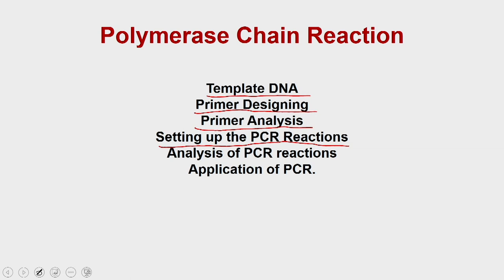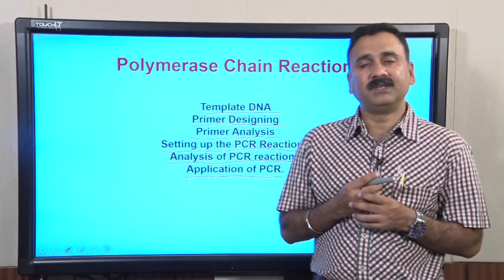reactions, how to add the individual components, and what precautions you should take while setting up the PCR reactions, and we'll take you to our lab and show you how to set up these reactions. In addition, we will show how to set up the different steps within the thermal cyclers, and at the end we will show you a demo of how to prepare and set up the PCR reactions. Once the PCR reactions are over, we will take out those reaction products and analyze them on agarose gels. And at the end of this lecture, we are also going to discuss the potentials of PCR in biomedical research or biotechnology research.